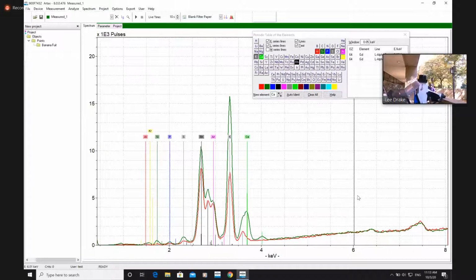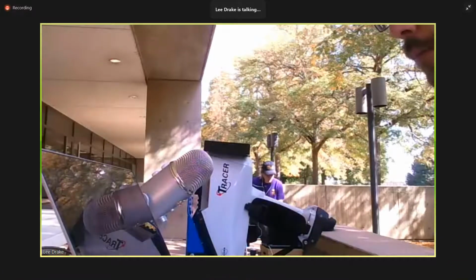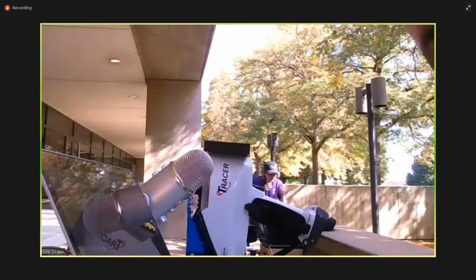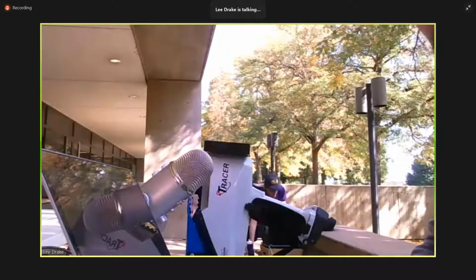But the good news is there's other foods that we eat that are different. And so that's going to bring us to our next step. We're going to take the peel off. We're going to stop sharing, and we're going to return to video. Now, what I'm going to do real quick is I'm going to set up our object here. Add spectra, remove object, and this is banana peel.